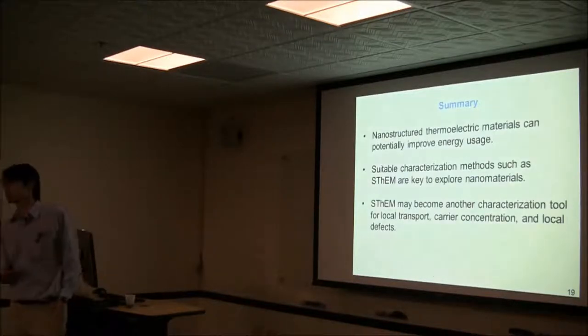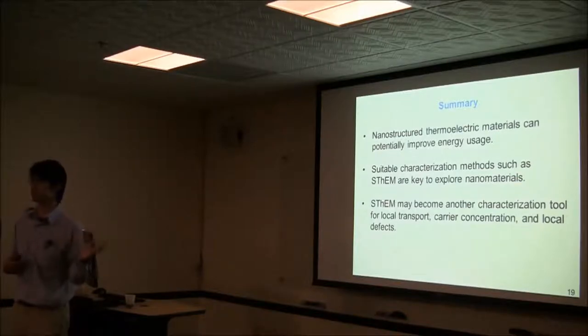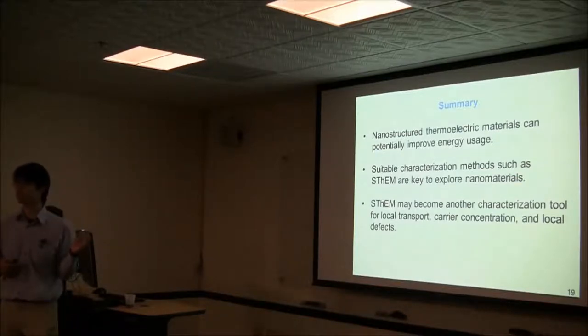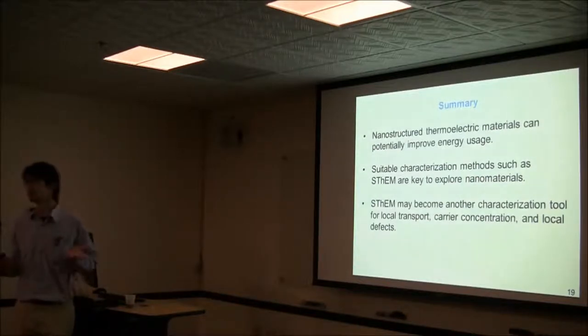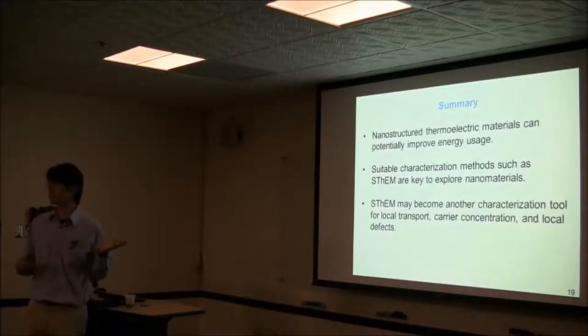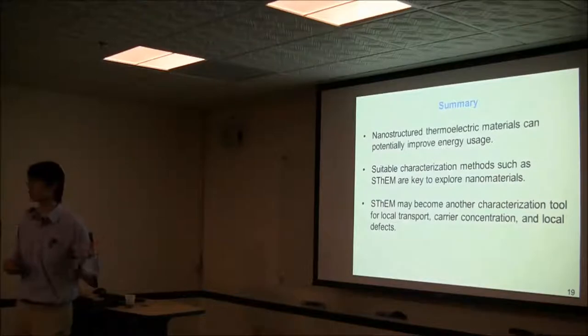Okay, so let me conclude my talk. I hope I convinced you that nanostructure material could potentially improve the thermoelectric conversion efficiency. And second, we really do need suitable characterization, such as scanning thermoelectric microscopy, to explore those nanostructure thermoelectric materials and improve the thermoelectric property.